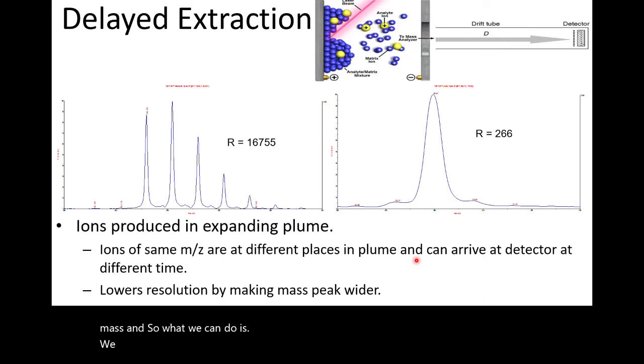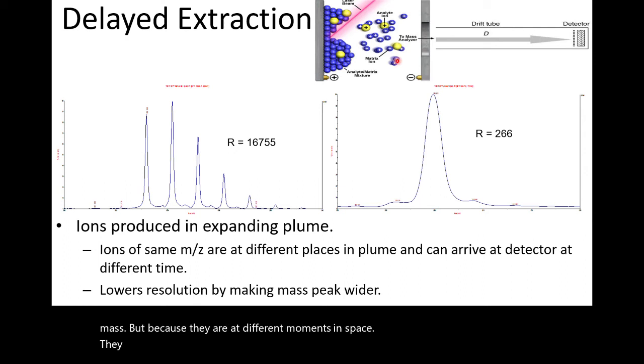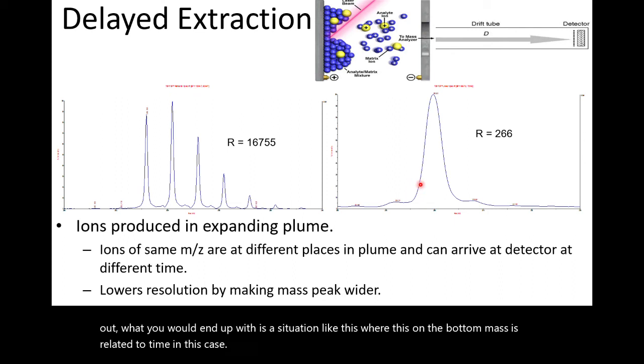Now, one of the problems that you may notice here is that let's say these yellow molecules are all of the same molecule and they are all of the same mass, but because they are at different moments in space, they are going to hit the detector at different times. So if you had these spread out, what you would end up with is a situation like this, where on the bottom, mass is related to time in this case. And because the molecules hit the detector over time, the mass resolution is not as high.